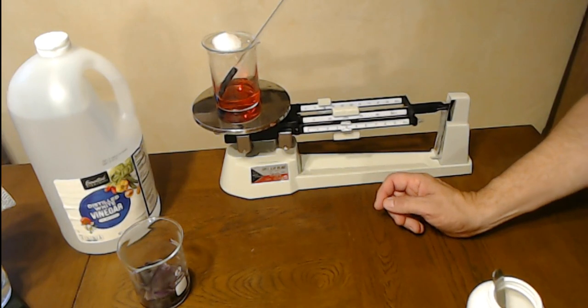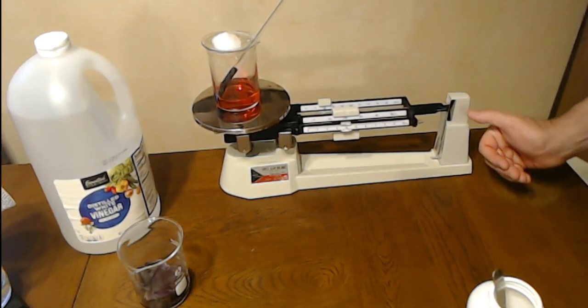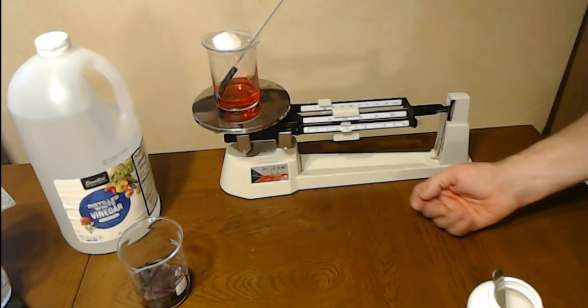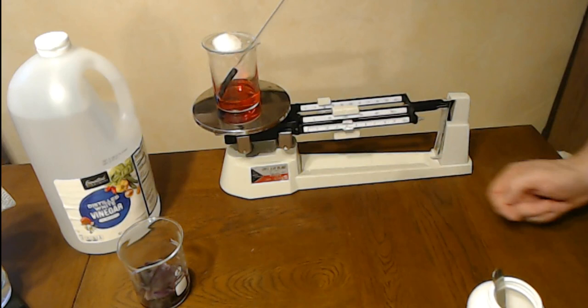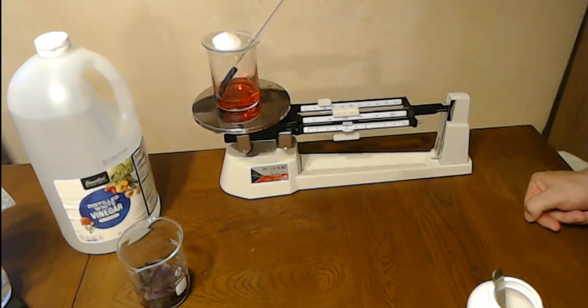We're pretty close. Let's see where it ends up. So watching this, looks like we're a little high, so that means we don't have enough weight on this side. So we're going to move it over just a hair. And looks like we're pretty close.